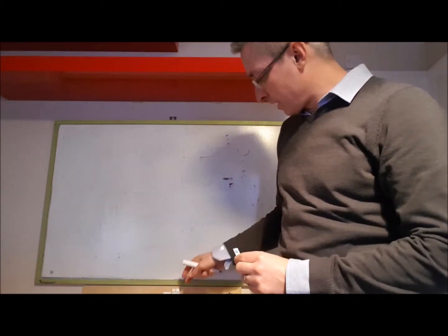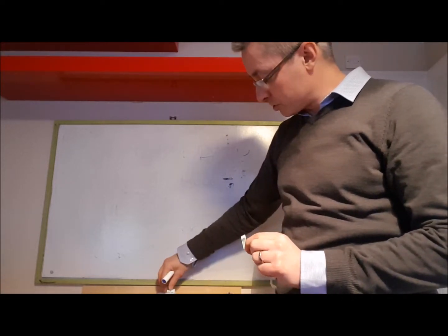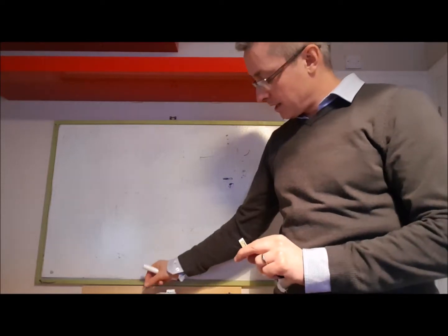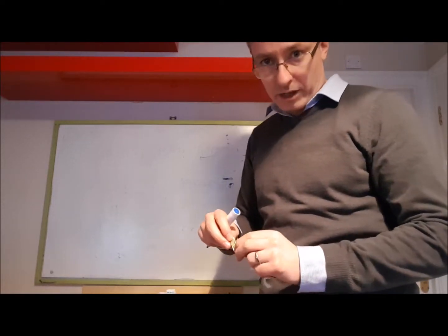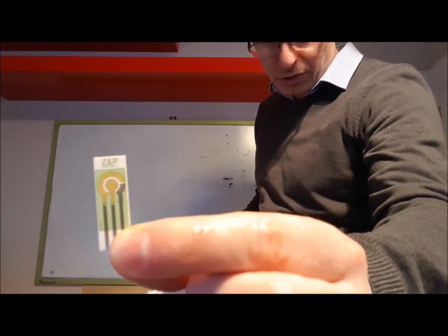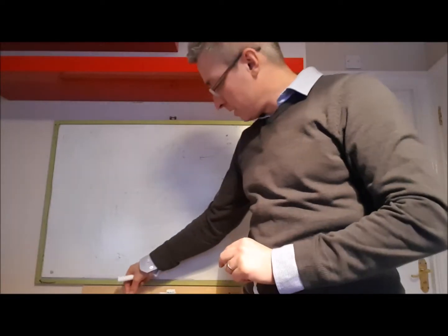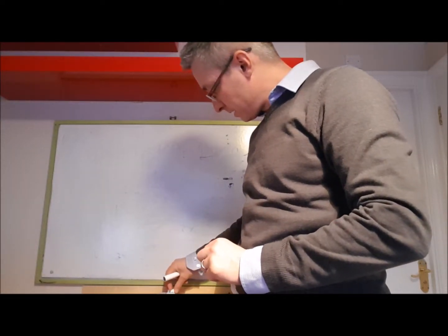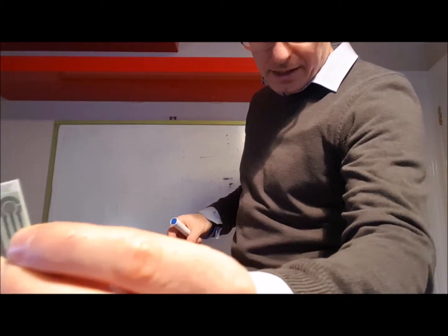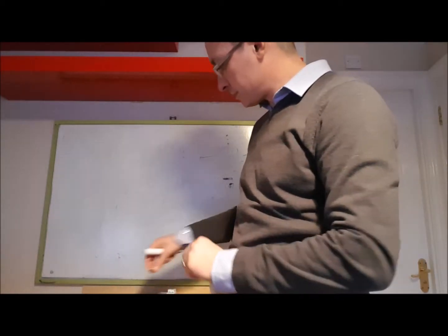Don't think that all of these electrodes are actually going to be degraded by engine oil. Some of these are actually quite robust. They're made at 850 degrees C. They can withstand organic solvents quite well. This is a gold one, on a ceramic. He's made at 850 degrees C, so he's kind of intrinsically quite robust. There's a platinum equivalent of him, again made at very high temperature, good resistance to organic solvents.